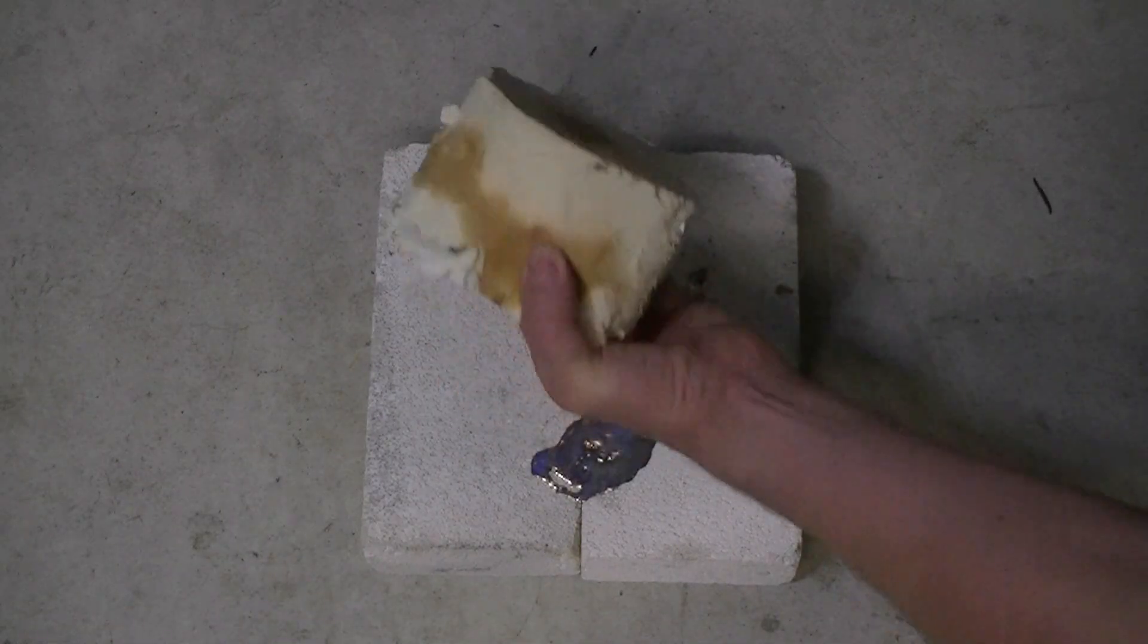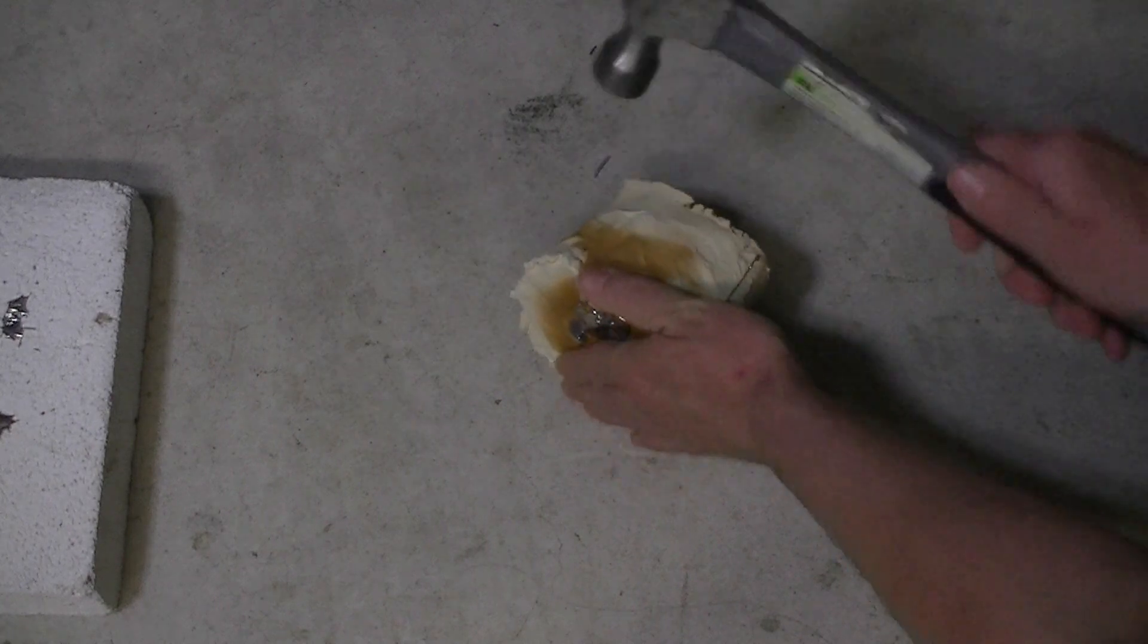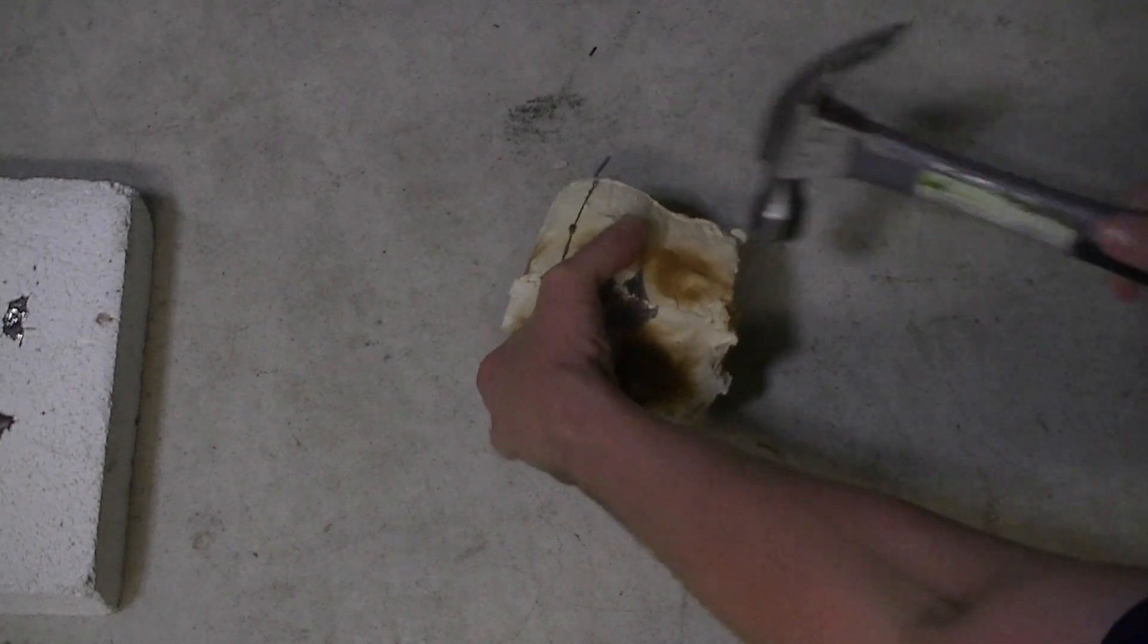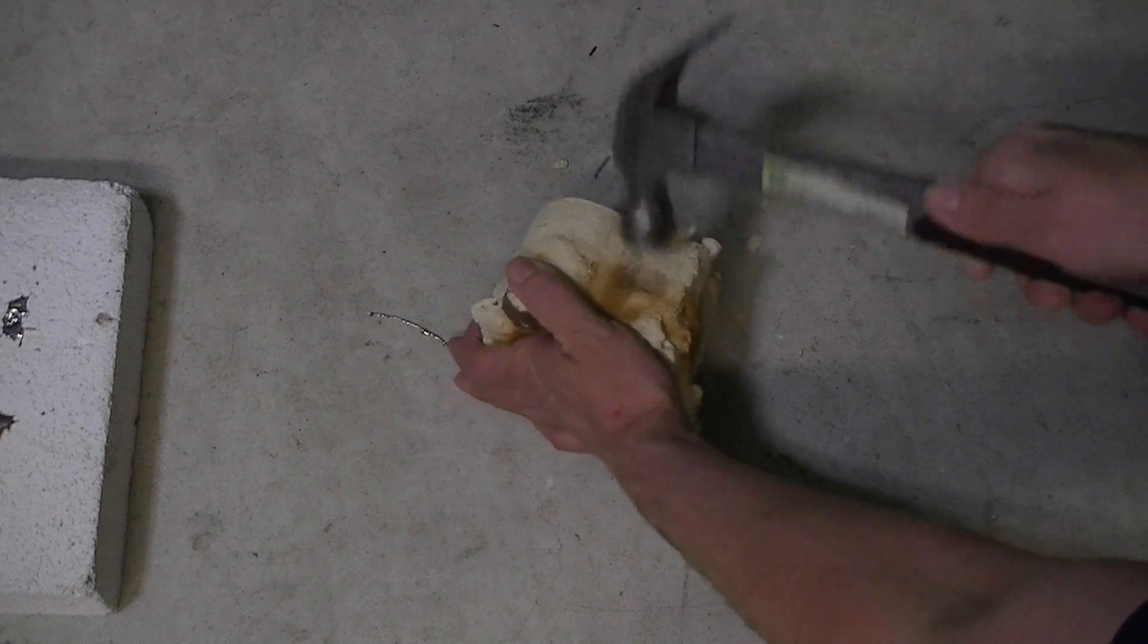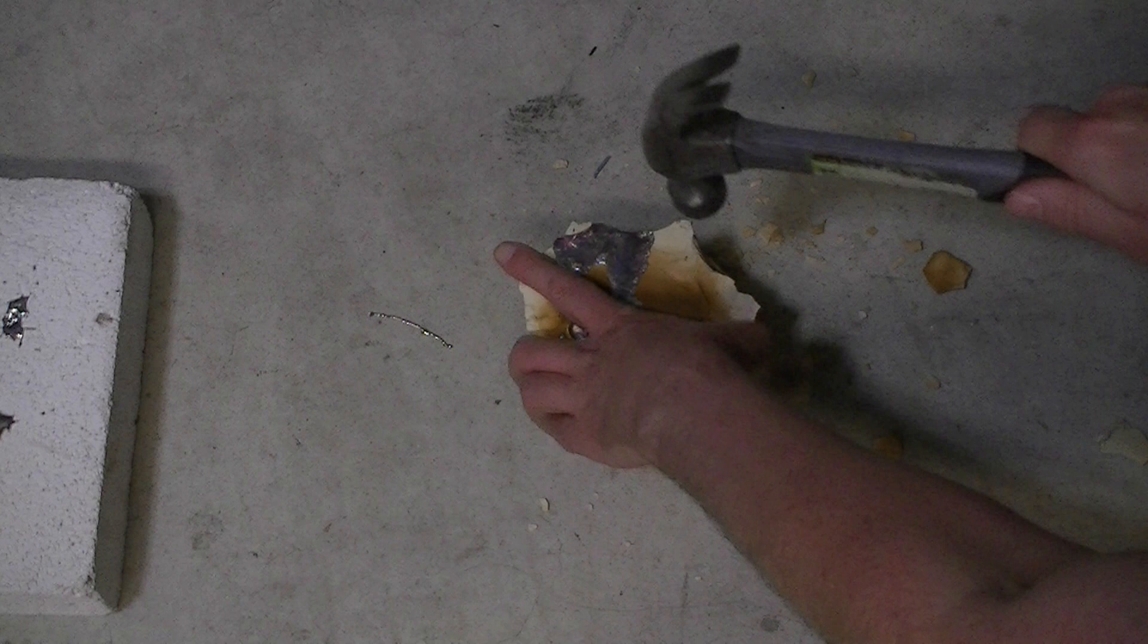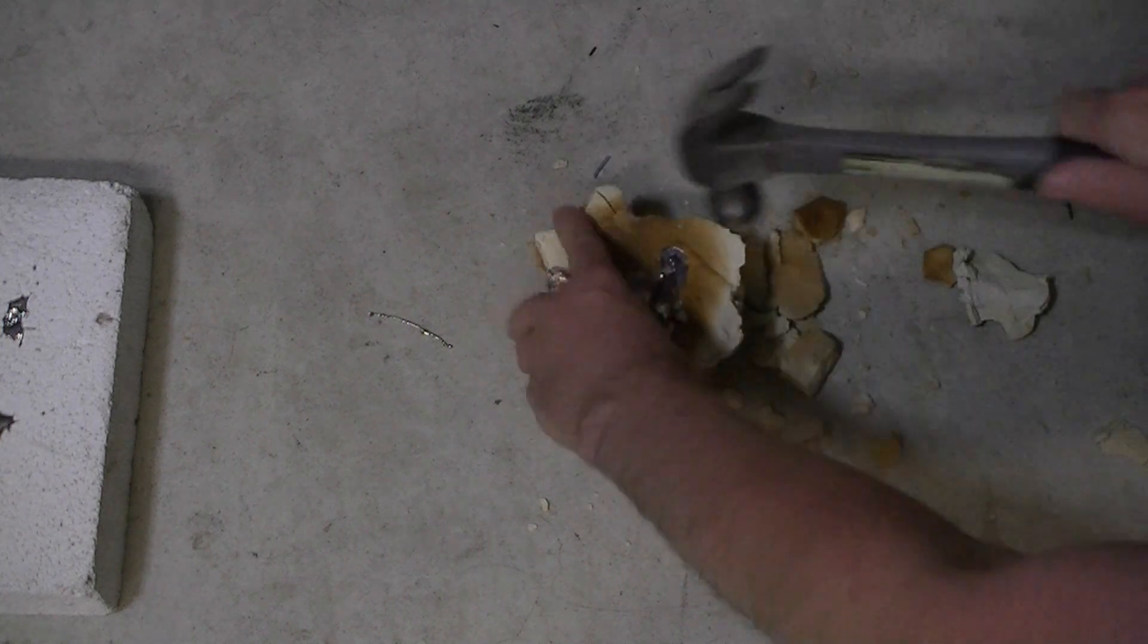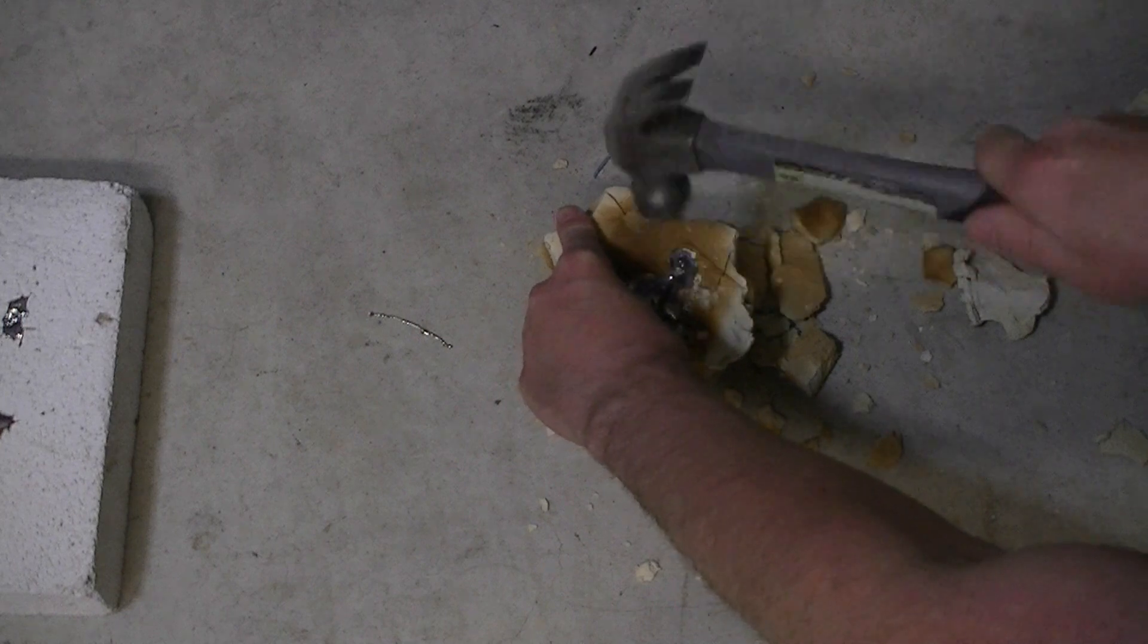After the molten bismuth has solidified and cooled down to room temperature, we can now knock the ceramic mold off the bismuth. In this case, we're using a hammer. Pure bismuth metal is a brittle material so we need to be gentle when we're tapping with our hammer not to fracture our bismuth.